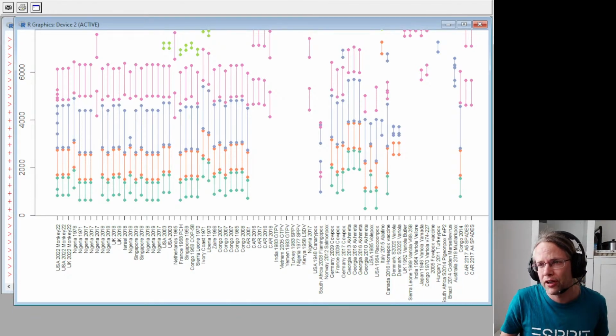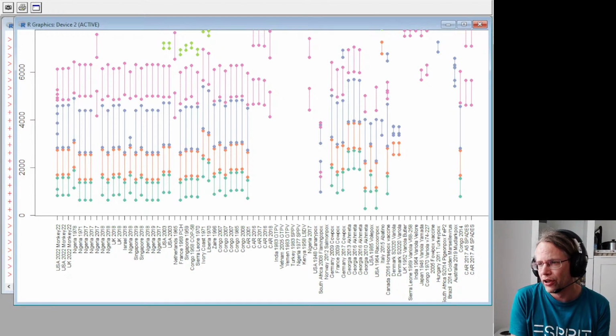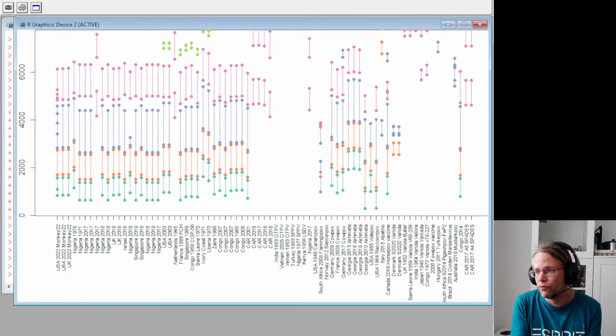But for me, this is what I wanted to show you guys, to show you how easy it is to use R using several packages to get an idea of what's going on and do real bioinformatics, even with just following a basic programming course in R. From the R course, which generally is like 12 lectures, we've now done like 6 lectures.